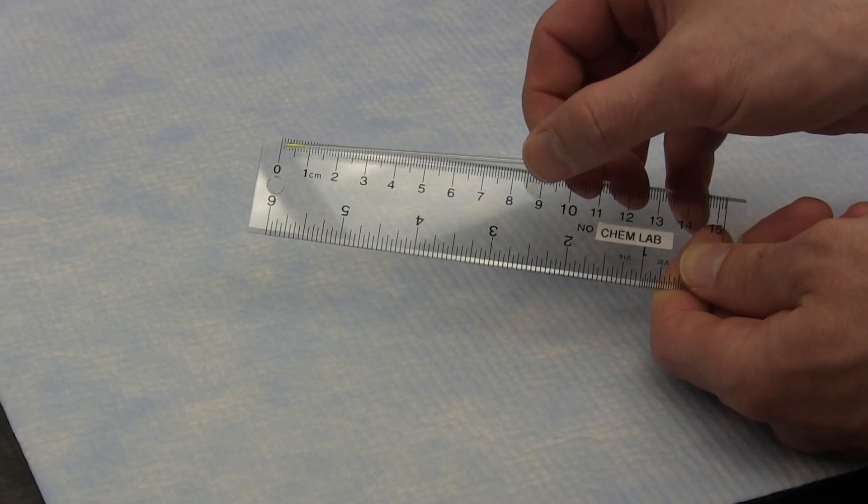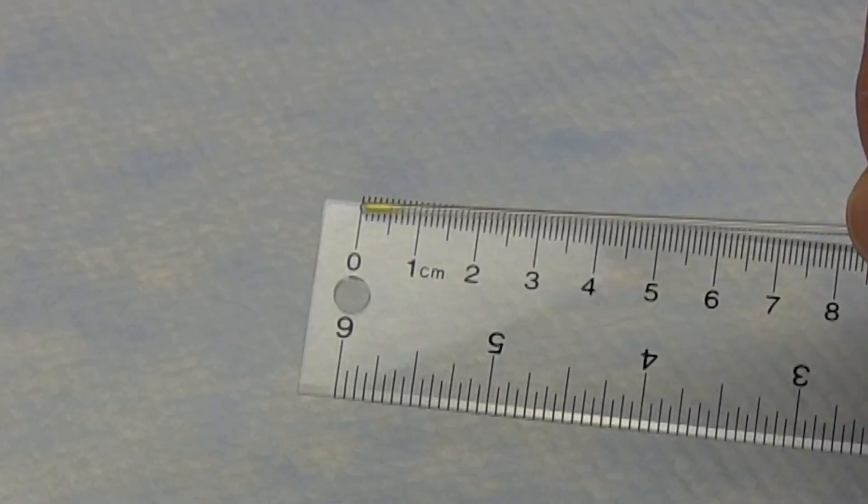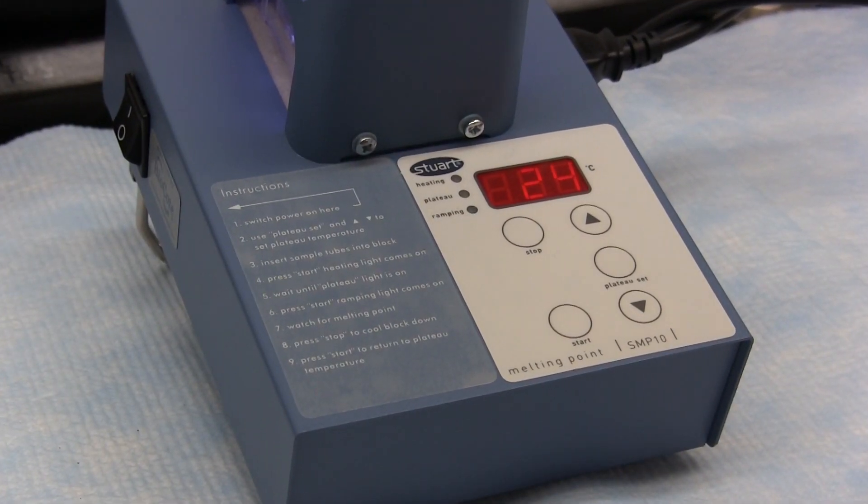You should try for a packed sample size at the bottom of the tube of a few millimetres. You now need to decide on a suitable plateau temperature, which should be about 10 degrees below the expected melting point of the sample.